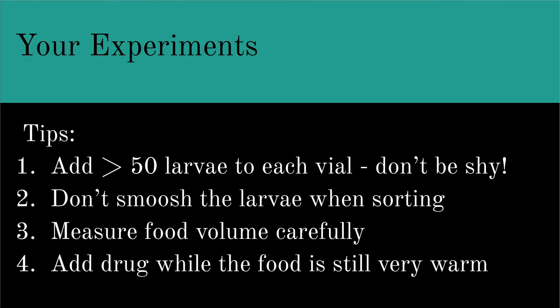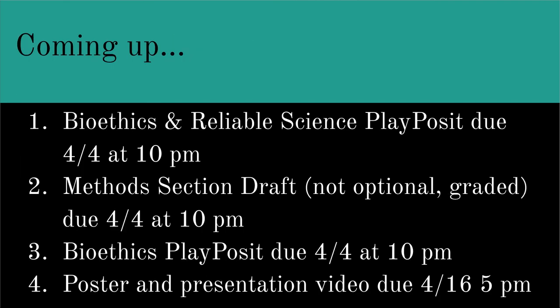And make sure that you're adding the drug to the food while the food is still really warm. You shouldn't see a track where your pipette tip was or like divots in the surface of the food. It's going to make it harder for the drug to diffuse evenly through the food if it's just plunked into a single channel. So just make sure that the food is quite warm.